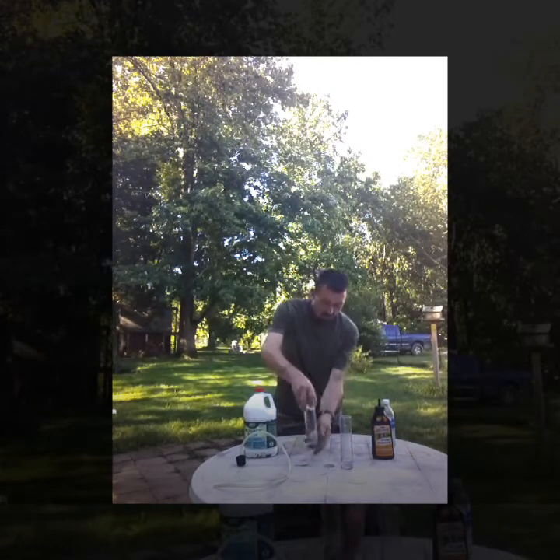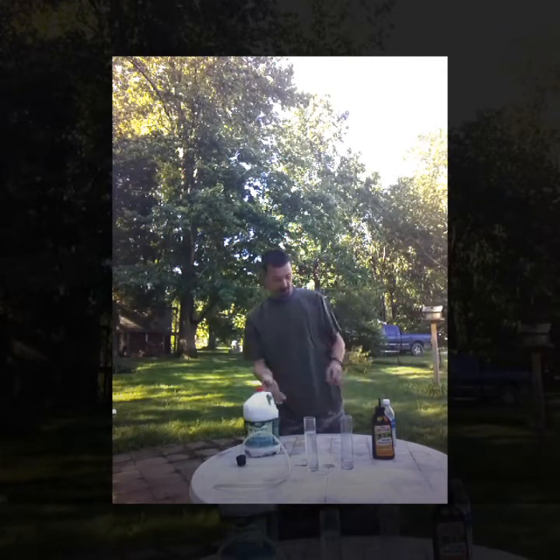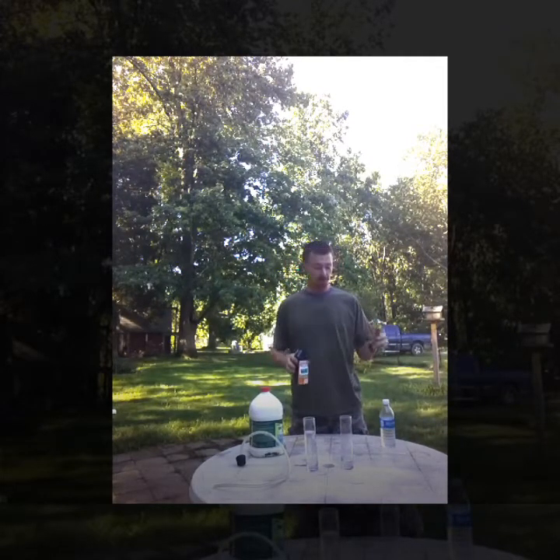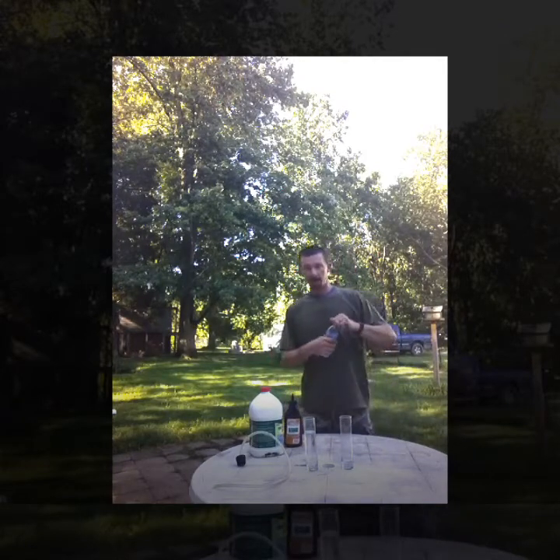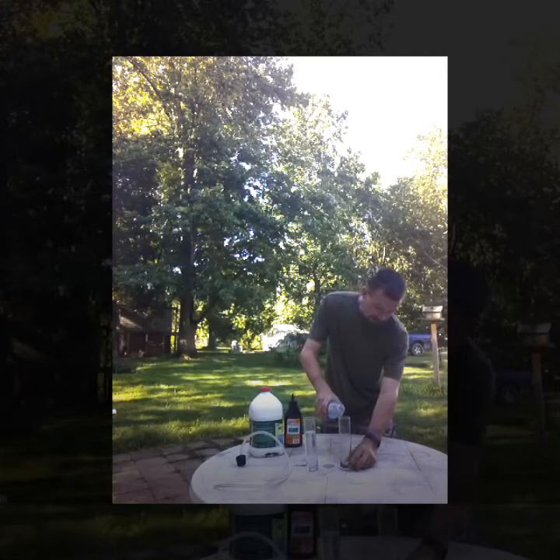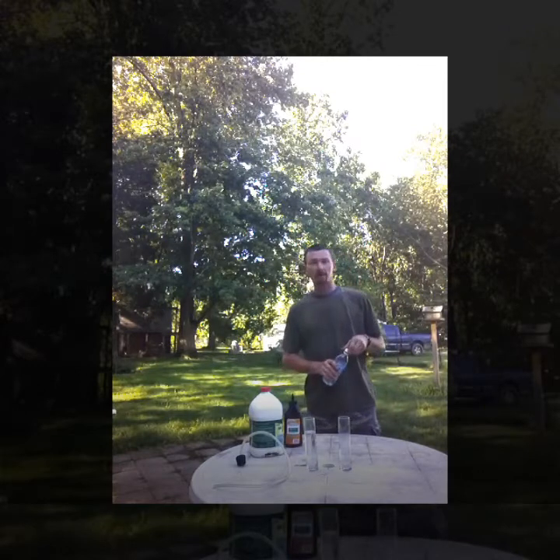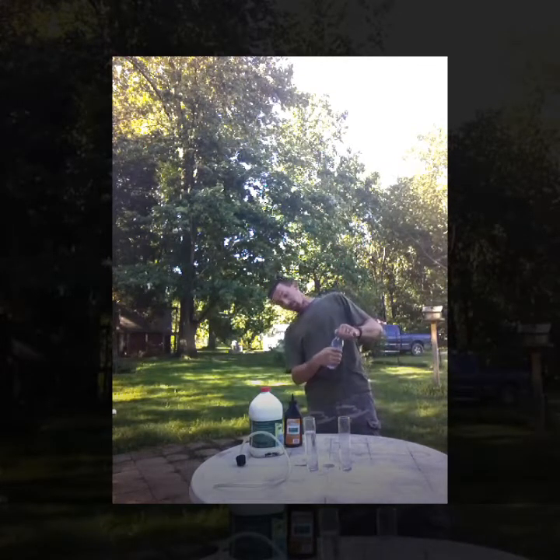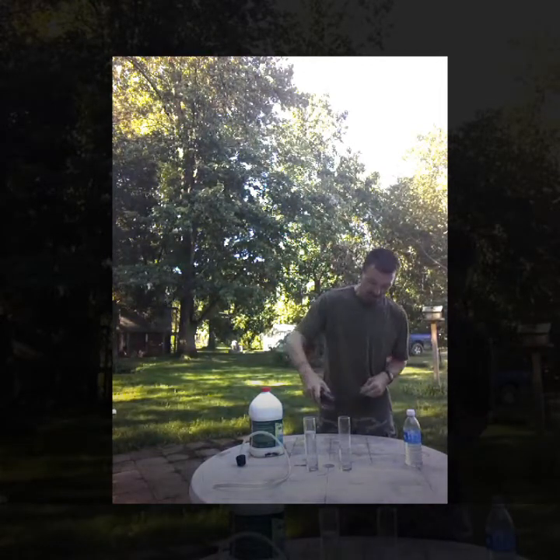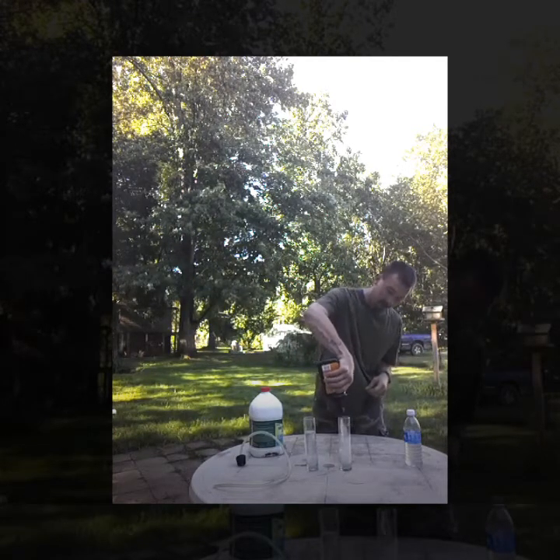Now, yes, for any science experiment you should measure what you're putting in. I do it like I cook — a little bit of this, a little bit of that. Good amount of distilled water in here, about a quarter to a third of the vial. Then you're going to go ahead and put your potassium nitrate in there. I like to get it good and cloudy.